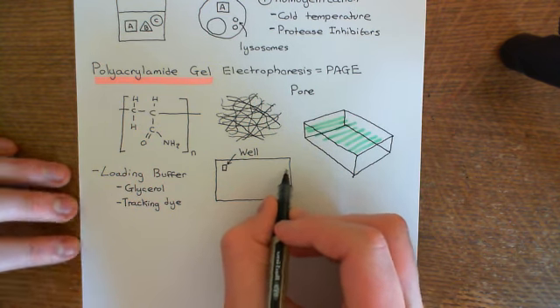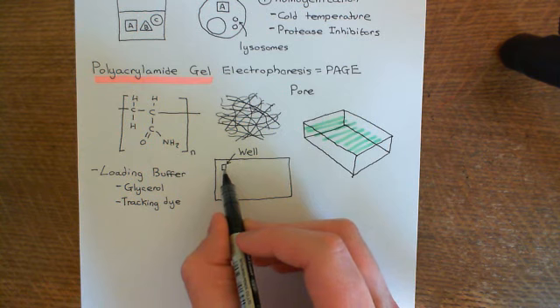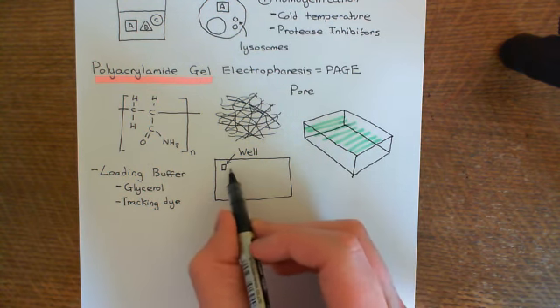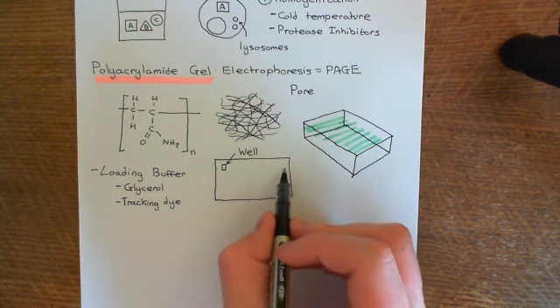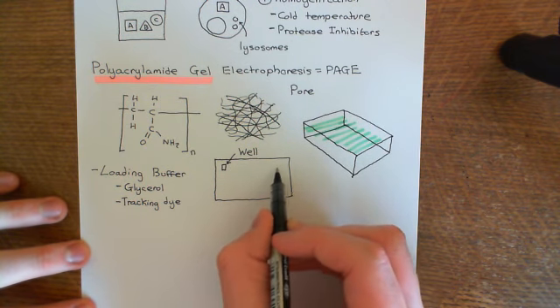Because if you leave it on so long that the contents of the stuff we've put in the well can get to the other side of the gel, then everything can just gradually get to the other side. And the point of this is to separate out the different proteins. So if you leave it on too long, they all end up right at the end down here, because they will all eventually make their way through the polyacrylamide gel. They'll just take different amounts of time to do that. So you need a tracking dye to tell you how far the mixture has got.